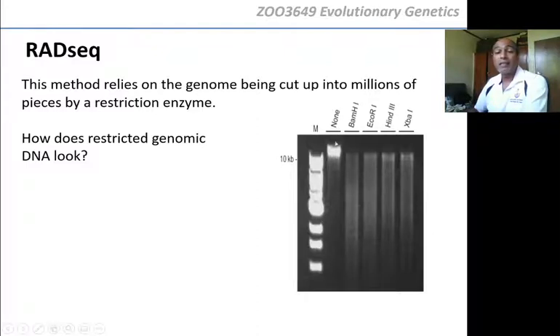Here it says none. This is DNA which we did not digest with the restriction enzyme. We didn't restrict it. Okay? This is just the DNA where we didn't put an enzyme in. This is what unrestricted DNA looks like. A very good DNA extraction will look like this, where you have all the pieces of DNA in what we call high molecular weight. That means they are all big pieces of DNA. You don't see anything smaller, because there's been no restriction. It's just extracted, isolated DNA.